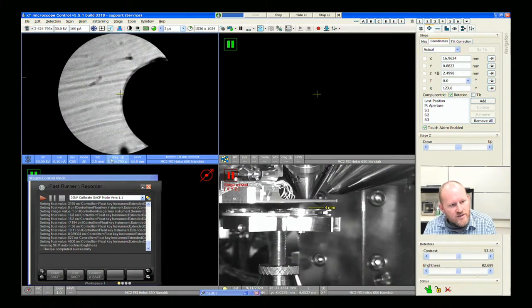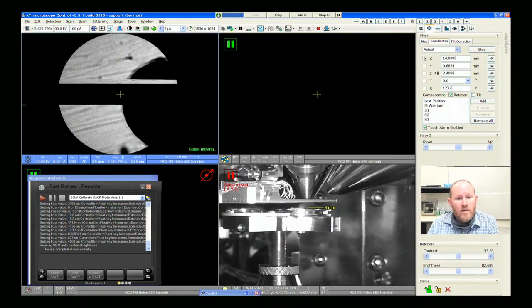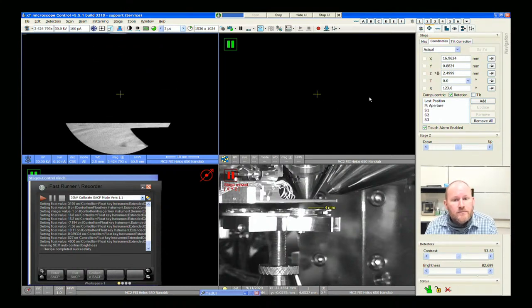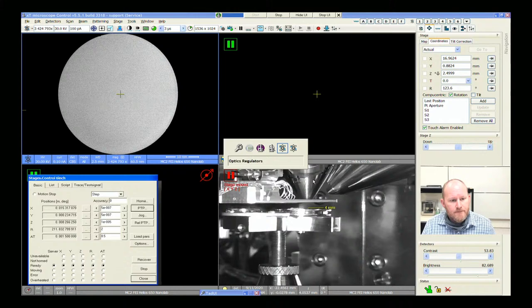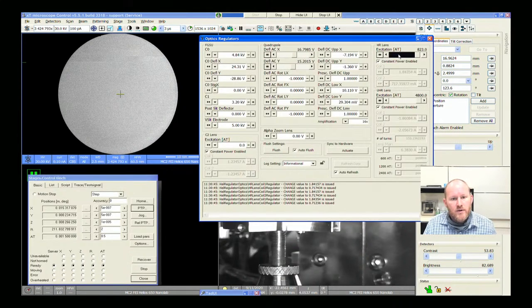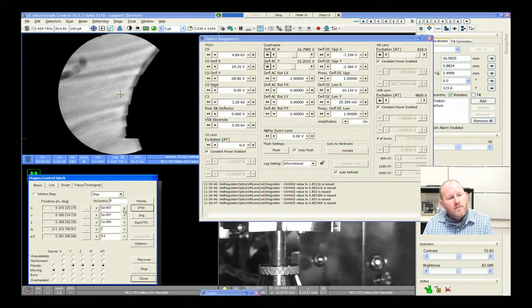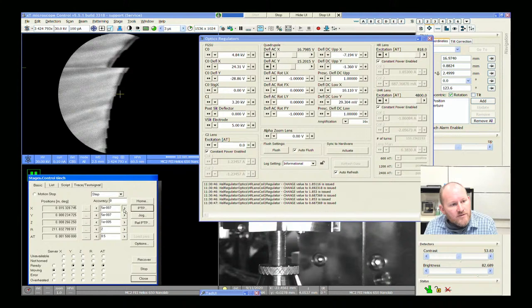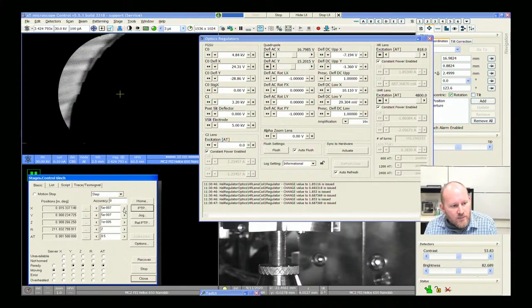The joystick stage movements don't work because it thinks I'm at 3.5 million magnification — it's going to move nanometers. So basically I'm just directly addressing the stage, doing X movements. I just want to put the beam right in the middle of the Faraday cup to see what sort of beam current we have.